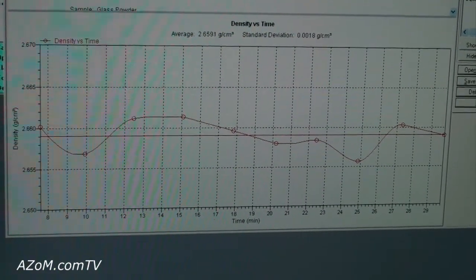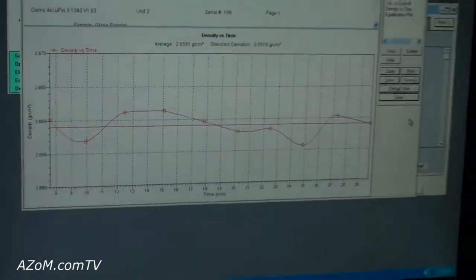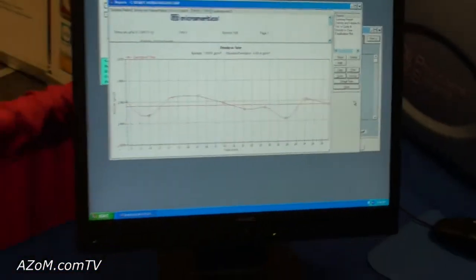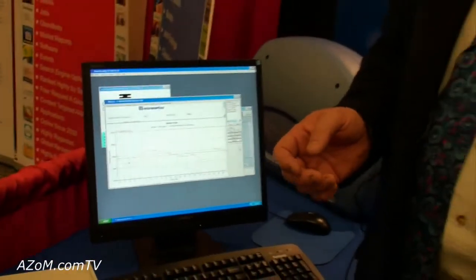So, this is the kind of data that one can get from this instrument. We can look at powders, we can analyze solids, we can analyze slurries, and frequently people are interested in the percent solids in a slurry. That can easily be analyzed with the ACUPIC.